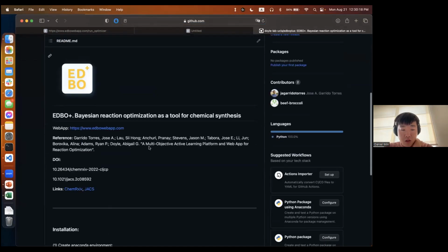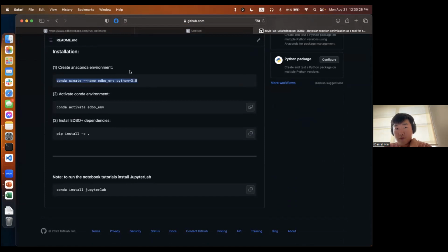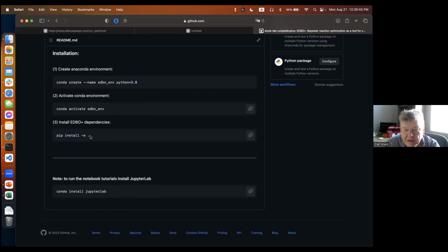If you go to our GitHub, we actually list the prerequisites. We recommend using a conda environment, and we have all the required libraries in a setup file, and this should satisfy all the dependencies. Excellent, because then people can run it in-house, which particularly in industry, a lot of people will prefer. Right. We also have the code for the web app, which is not open source right now, but we have helped some companies install the web app internally on their servers. It's a bit more involved, but people have reached out to us, and we have helped them with that.